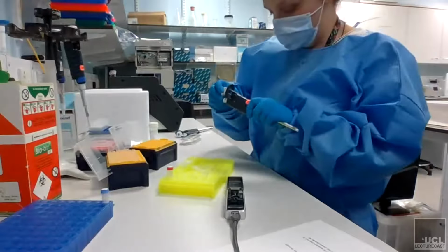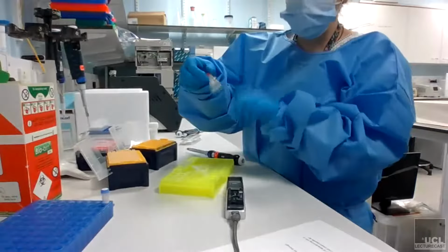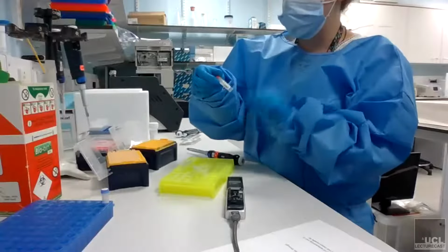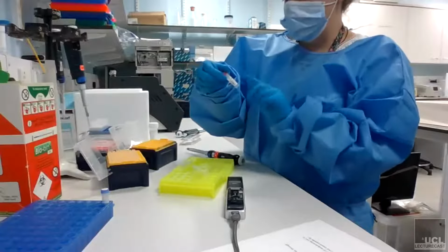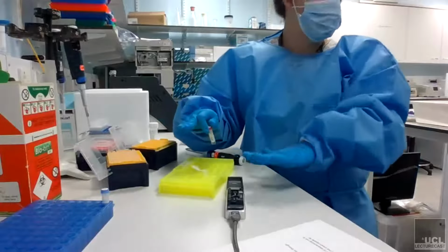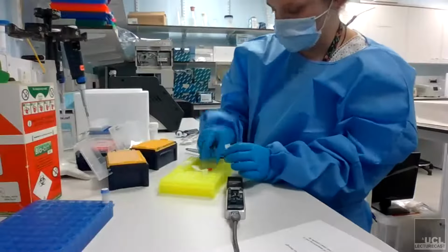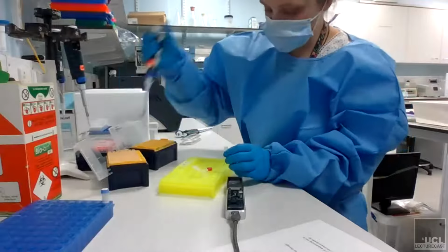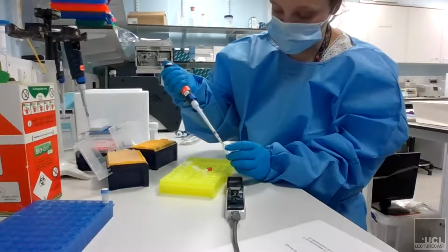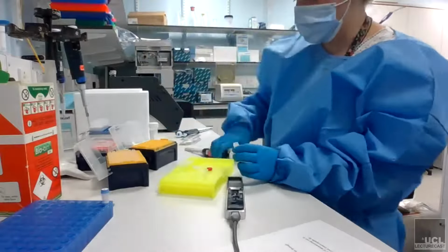25.5 microliters of loading beads. Again, make sure you give these a good flick just before you put them in, because the beads will all settle to the bottom. I believe the beads keep the sample down close to the pores, so it's not floating around on top of the channel. You can mix these with the pipette, because this isn't our DNA.